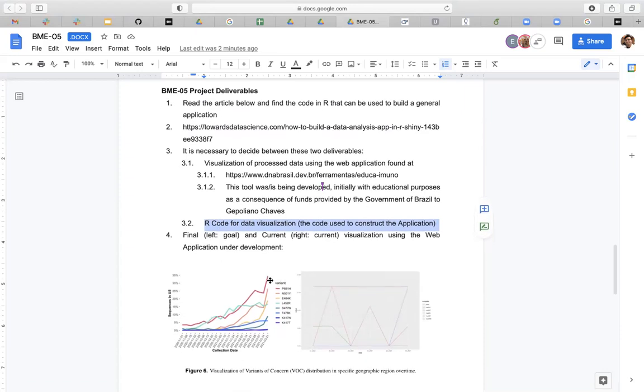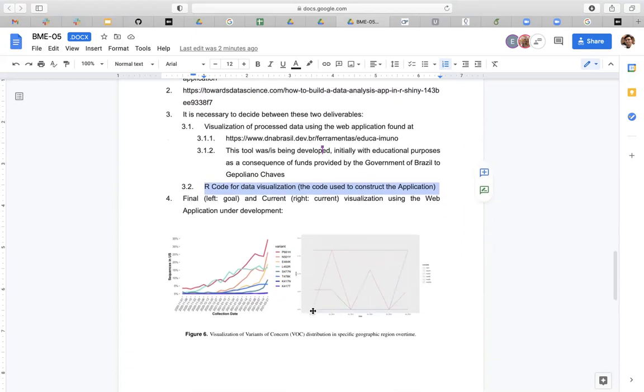And this is a visualization. Actually, the part on the right is a visualization of how the software is plotting the analysis that we are looking at. I think these are mutations that the software is plotting.